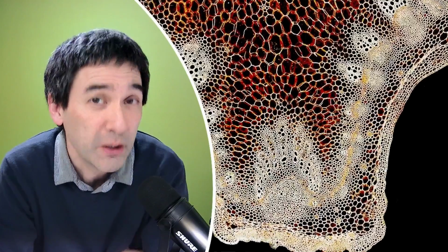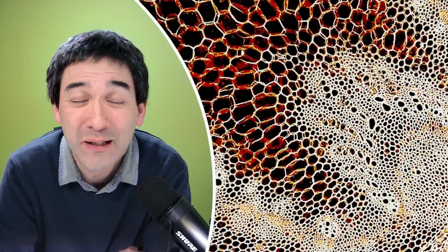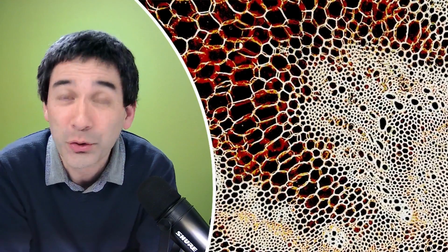And this pressure cooker is an autoclave, or is called an autoclave. And basically what happens is the following. To first answer the question: can we just use a regular pressure cooker as well? And the answer is yes. As a matter of fact, this is what I've used myself during the laboratory time when I was still at university. We bought a fairly large pressure cooker, and we used that essentially to autoclave and to sterilize equipment.